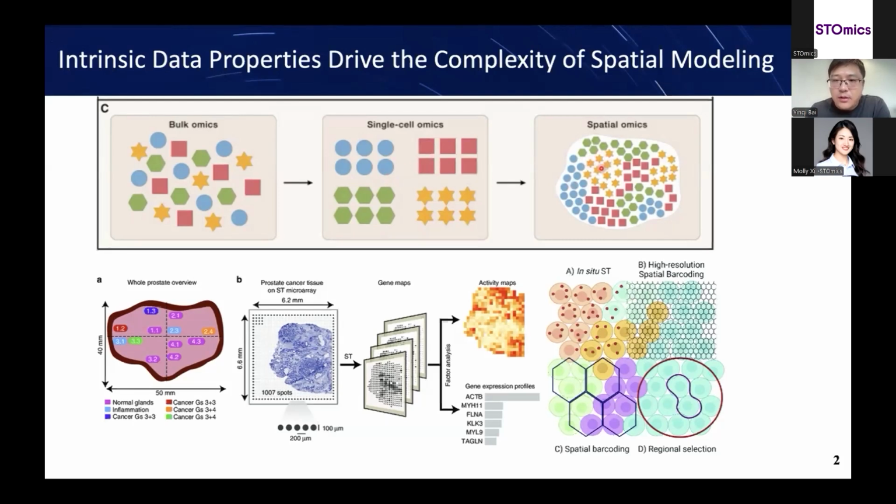It is a niche analysis, or we call it microenvironment analysis, for one target cell and its neighborhoods. There are not enough biological replicates to demonstrate your algorithm. So the spatial transcriptomics becomes quite complicated to analyze.